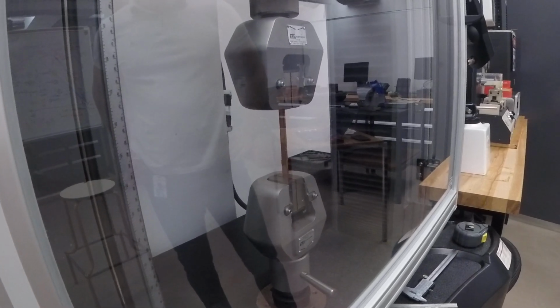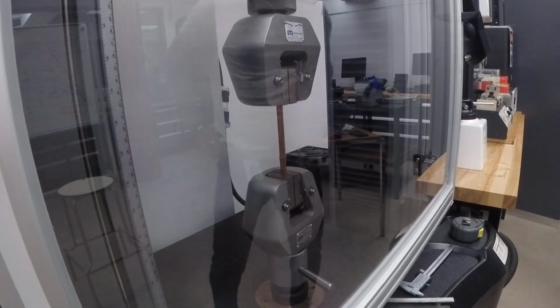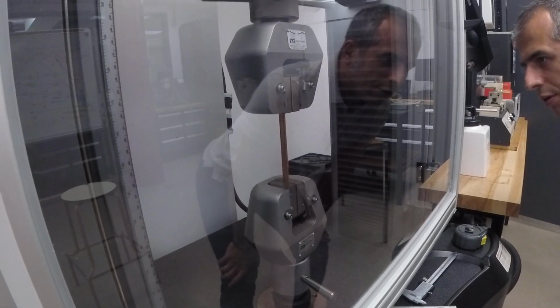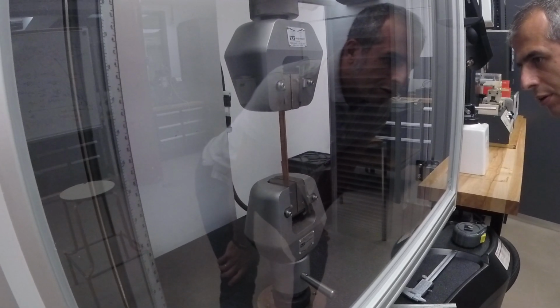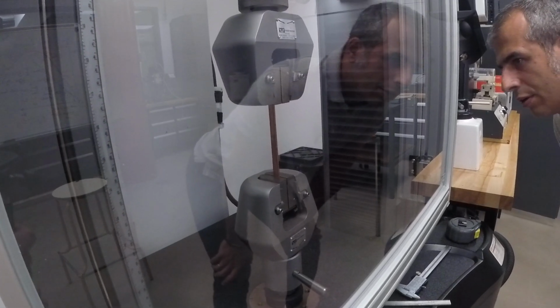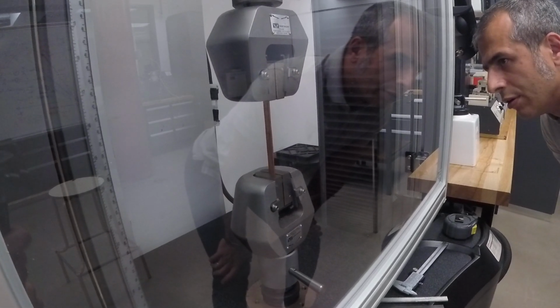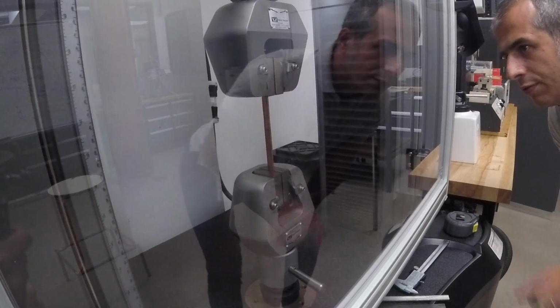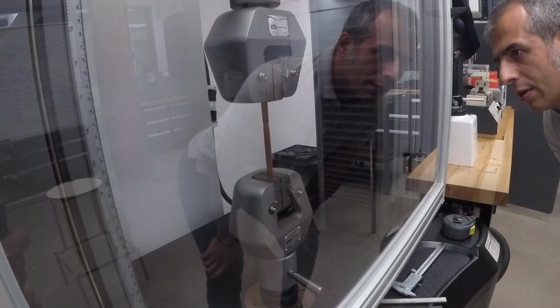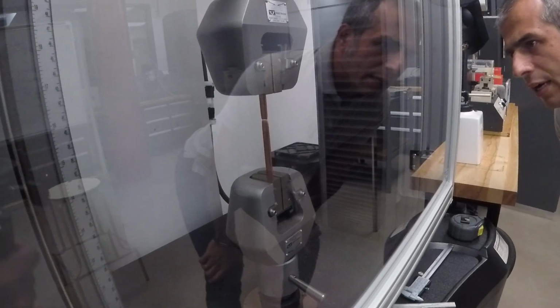It's going to have a very large plastic region. And now it starts moving down. You can see from the top, necking starts to apply. See, this is necking, and at the end breaking.